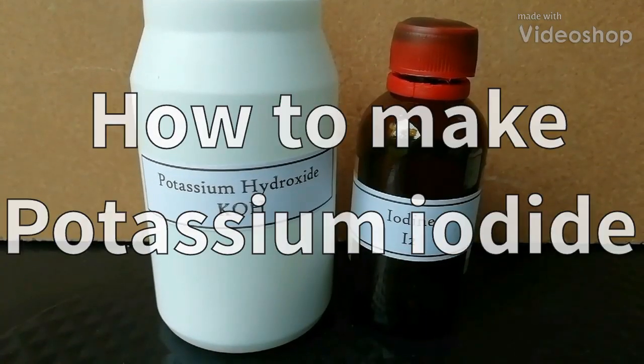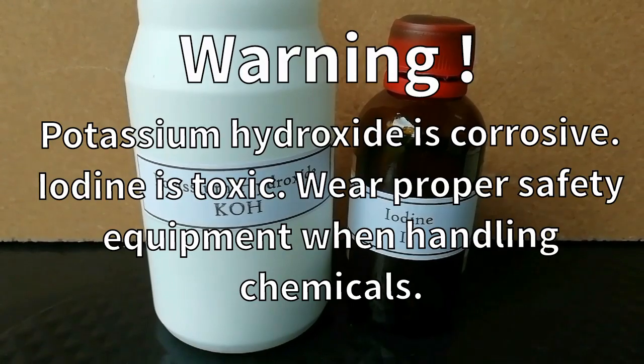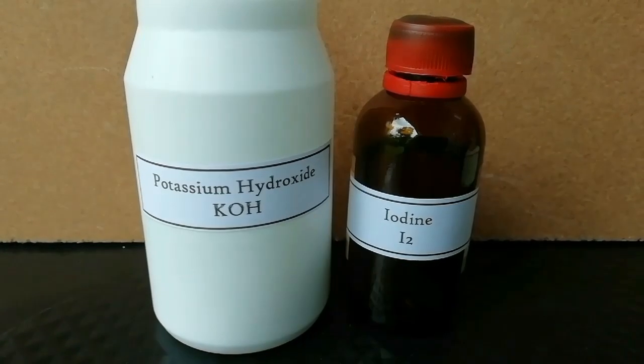How to make potassium iodide? Warning: potassium hydroxide is corrosive, iodine is toxic. Use proper safety equipment when handling chemicals.